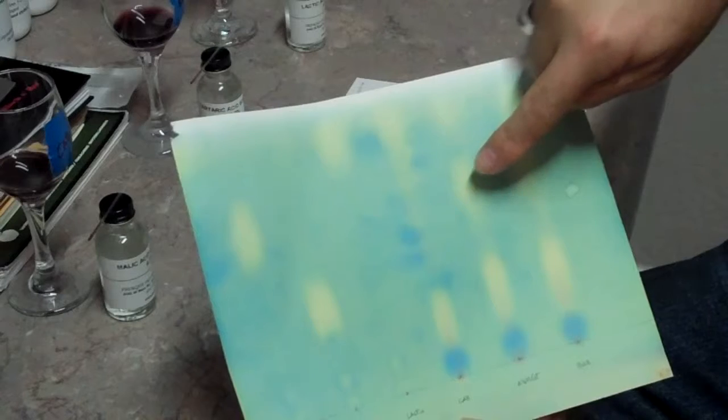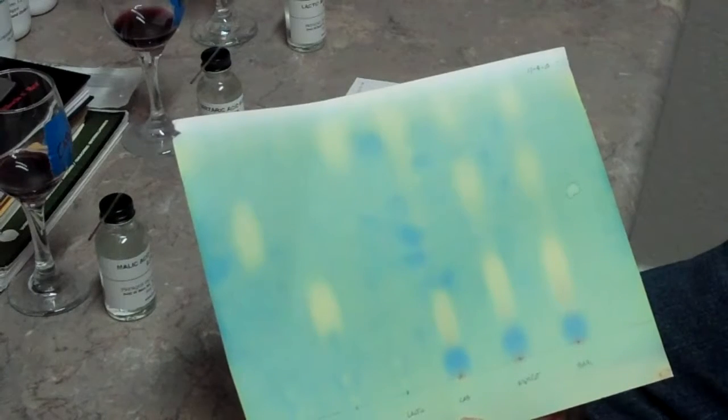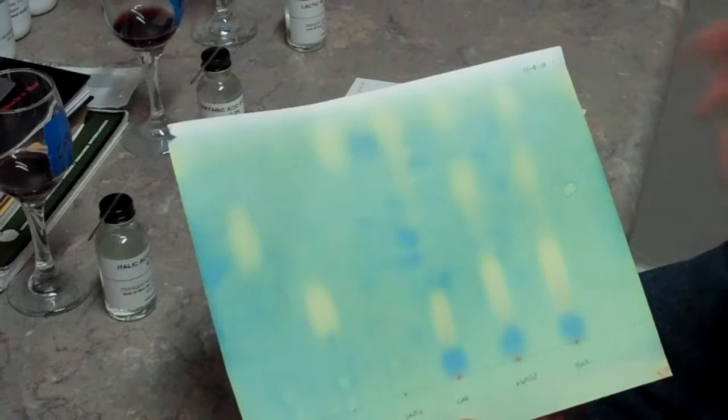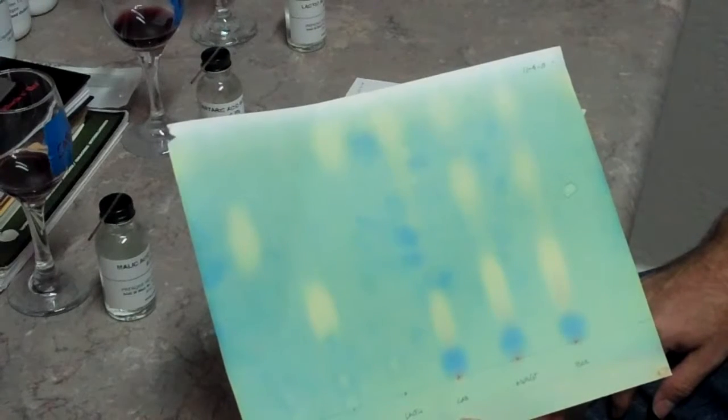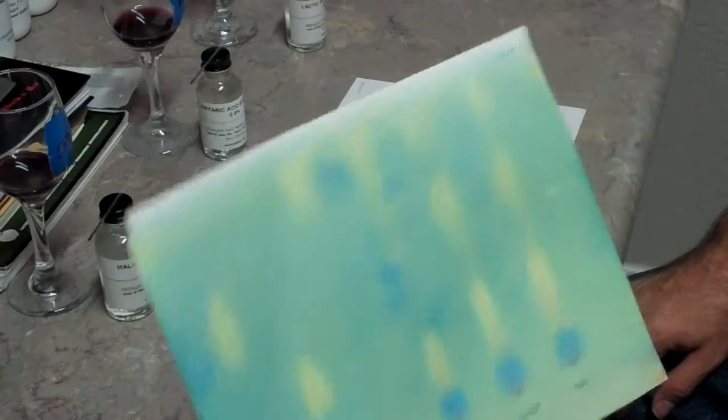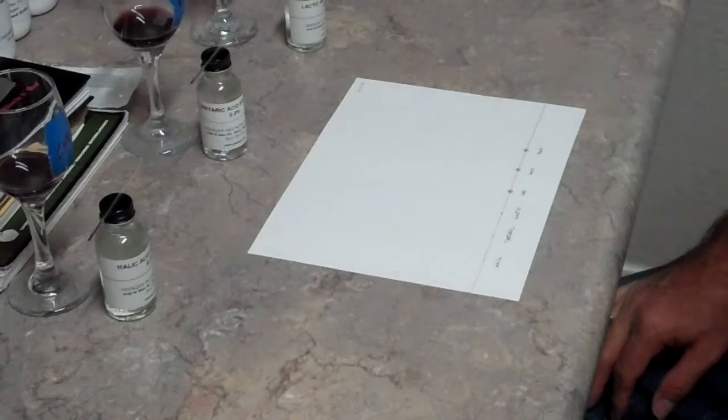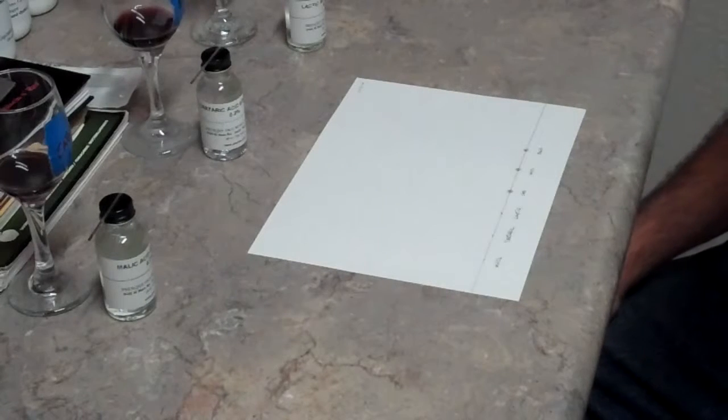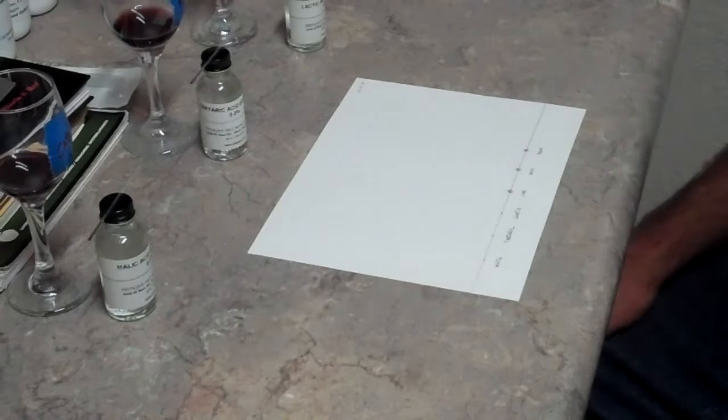I can see that I've got quite a bit of malic acid still in the Merlot and the Barbera, but I do have some lactic acid in it as well, so the conversion is happening. It'll be interesting to see how the test runs this time, which is about three weeks after that initial test was done.